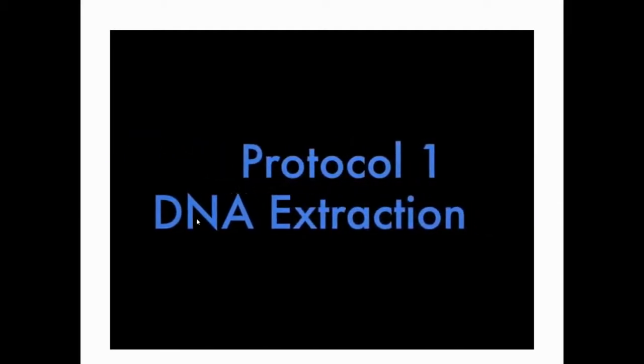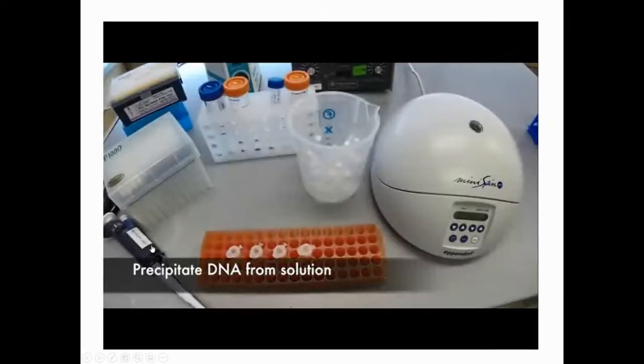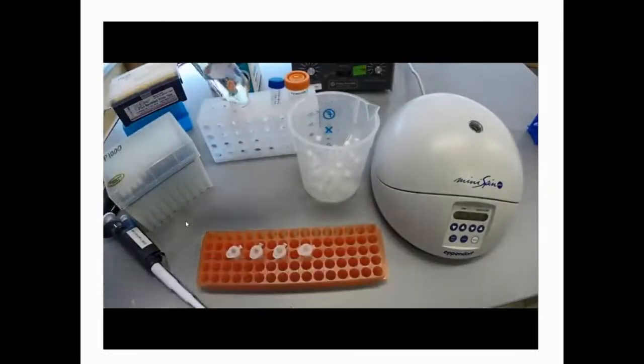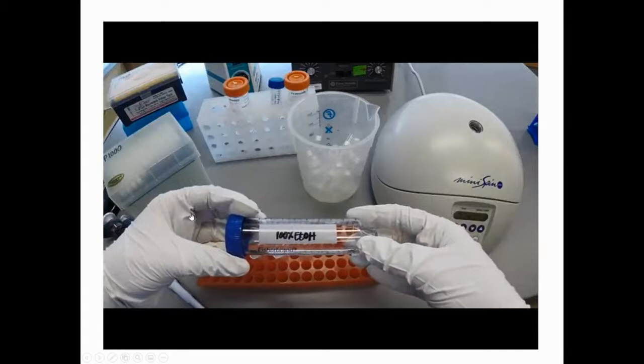Let's go to the step here, part 2. Precipitate the DNA from solution by adding an equal volume of 100% ethanol to each. So basically, in this protocol, they use the inorganic method.